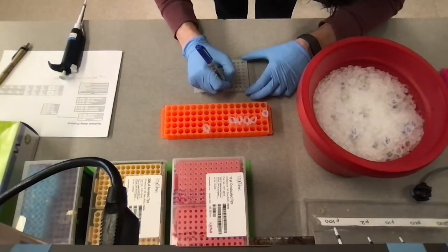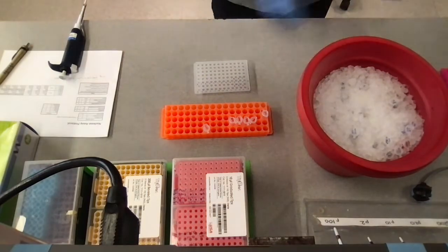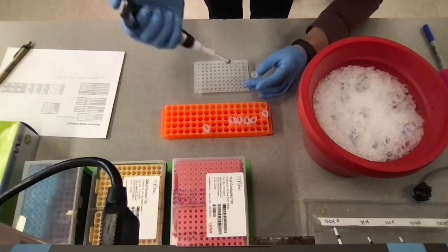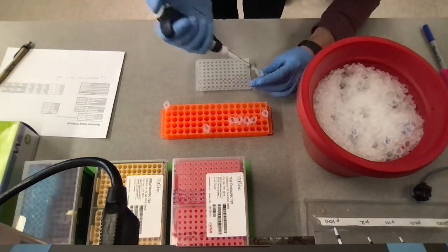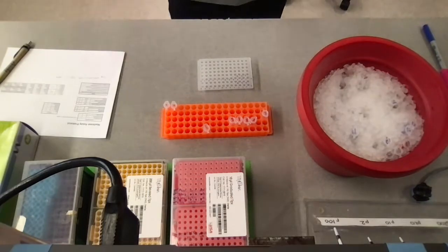Okay, now we have our plate ready to go, and we're going to start labeling it so that we have different groups for our DNA and our proteins. And then I'm going to go ahead and load in the DNA first. So that's all ready to go. We have 2 different types of DNA in here, one with an epigenetic marker on it and one that's just a regular set of DNA.